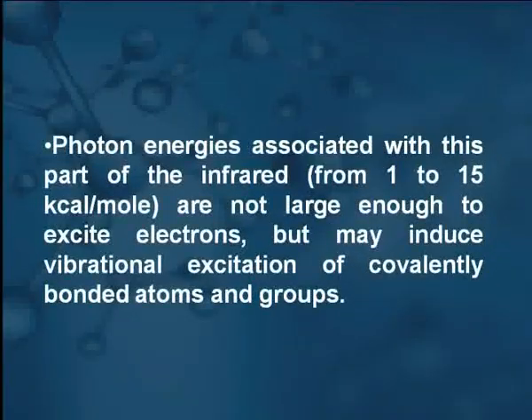So this is also important. Here we know why we are studying IR spectroscopy. We are getting the photon energy which is associated with the part of infrared radiation, in the range of 1 to 15 kilocalories per mole. This is not large enough to excite the electrons, but may induce the vibrational excitation of the covalently bonded atoms or groups. Means we are using the covalent bond for excitation of the vibrations. We get the vibrational excitation.